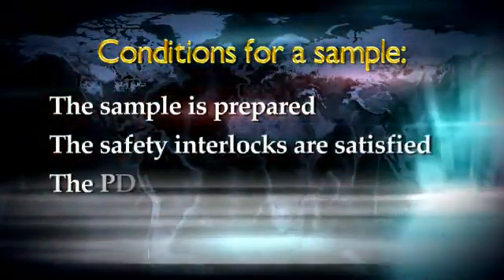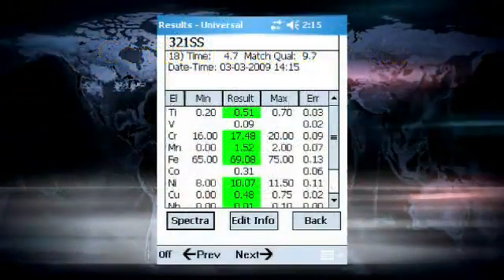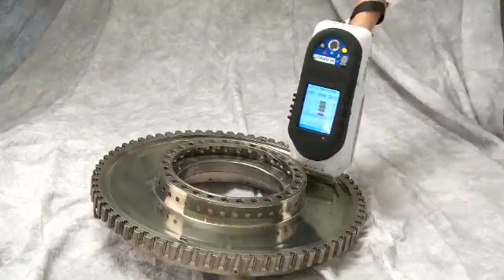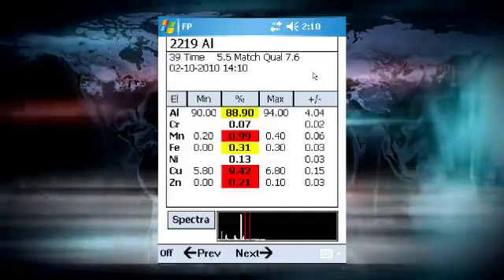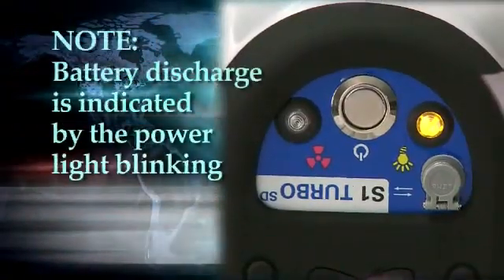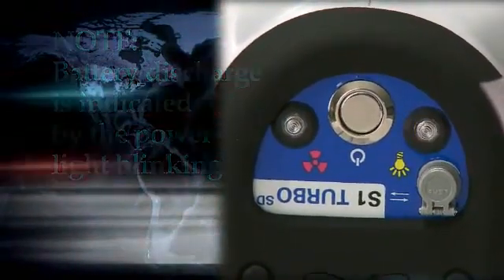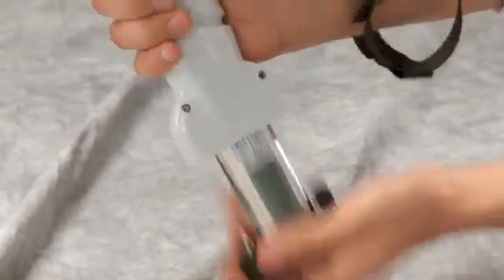Once the sample is prepared and the interlocks are satisfied, the final factor in starting the measurement is the state of the PDA software. There are two states where the analyzer can start an analysis: at the conclusion of the previous measurement or at the ready to analyze screen. If all of the conditions are met, then pulling the trigger on the instrument will start a measurement, indicated by the red light on the control panel and data appearing on the screen. If the red light goes off, the measurement will stop. Note that one cause of premature termination is that the battery has become discharged — the yellow light should blink indicating low battery charge. If the measurement ends prematurely, replace the handle battery with a fully charged one.